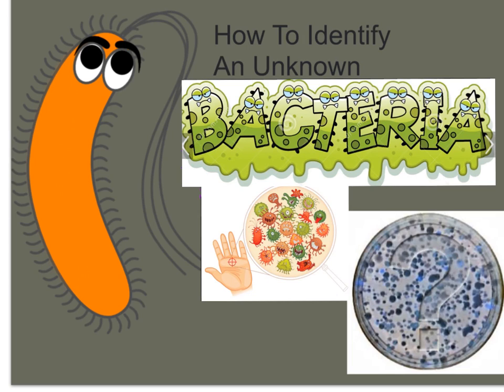The purpose of this video is to go over how to approach identifying an unknown bacteria from a list of known bacteria in a typical microbiology lab. The typical approach is to have this as one of the final labs of the year, and the unknown bacteria will typically be one of the bacteria that's been tested in the lab over the course of the semester. So how do you approach designing a protocol for identifying this unknown bacteria? That's what we're going to discuss.